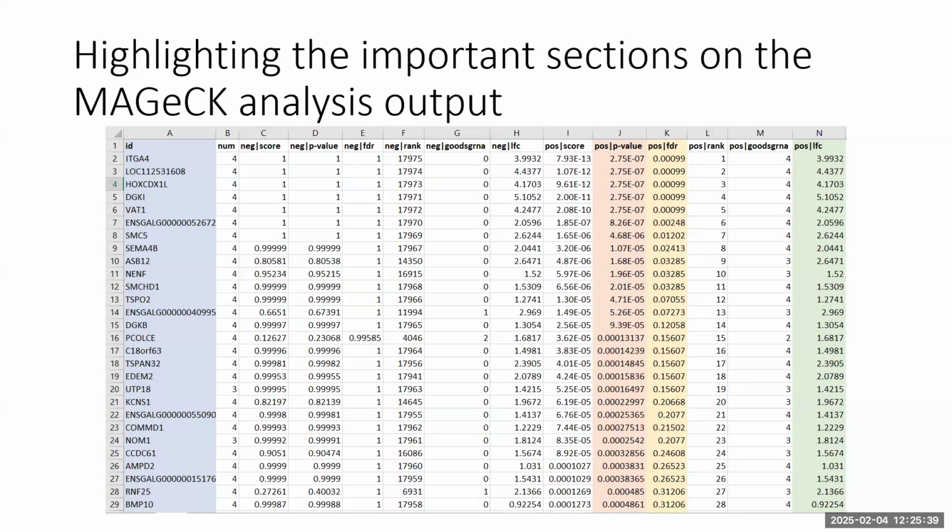This one's a bit of an odd one, actually. No, that's the other low, yeah. And then the high is the same. Essentially what this is showing is for all 4 guides, you've got a significant enrichment of that guide in the low population compared to the medium and the high. And the same pattern you see for the repeat in R18.